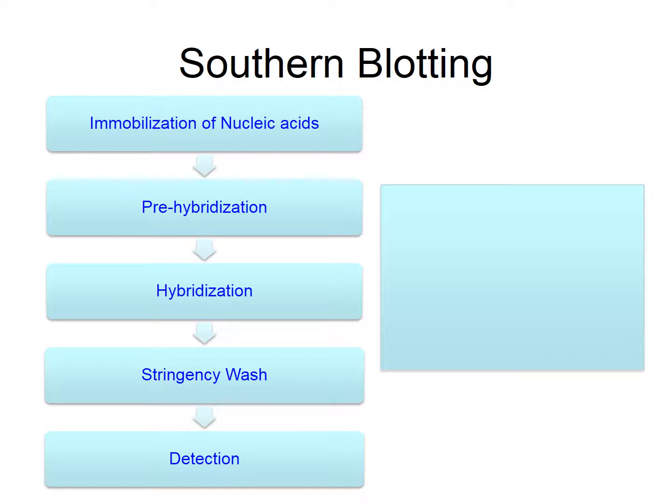Any particular probe you use will bind to a specific DNA sequence on this separated DNA bands and not to any other. So you take these probes and you allow them to react or bind with the DNA samples. Once you allow the DNA to bind, you allow something called stringent wash. You wash away the probes which have not been fixed. So all the unwanted probes are removed.